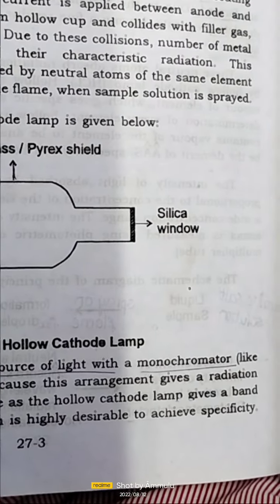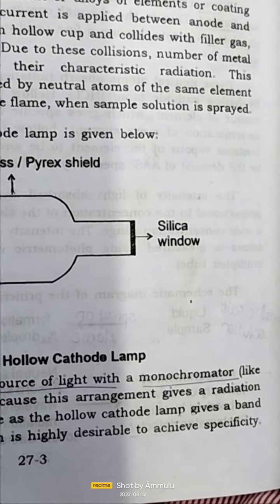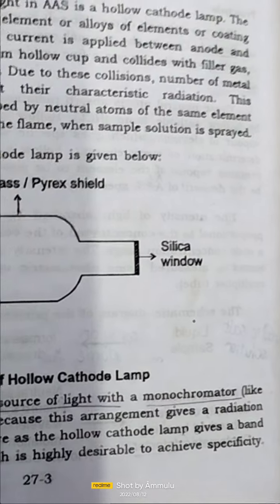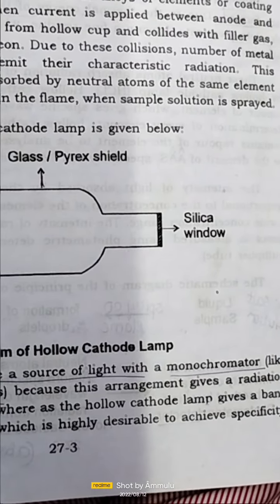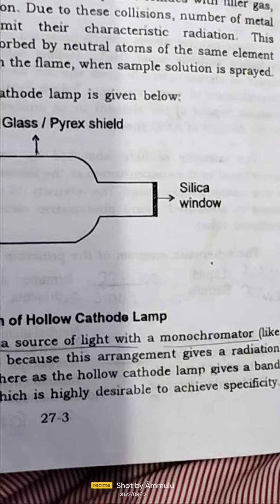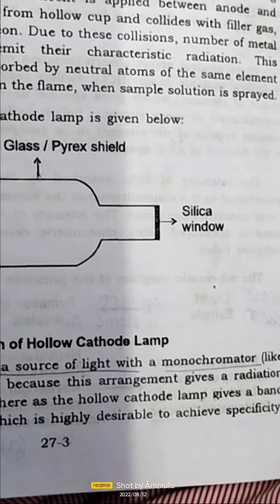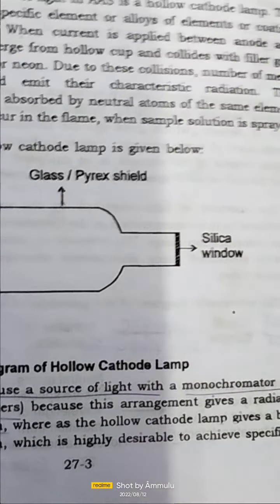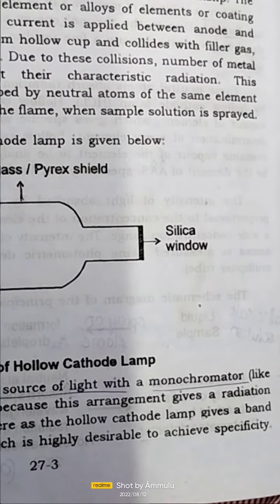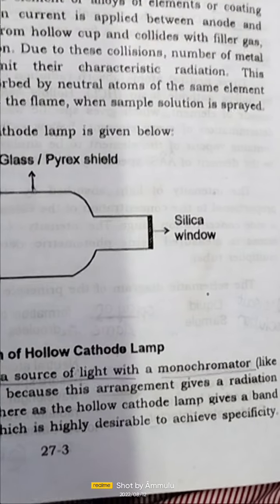The hollow cathode lamp is used as the source of light in atomic absorption spectroscopy. This cathode is made up of specific elements, or an alloy of elements is coated on the cathode.